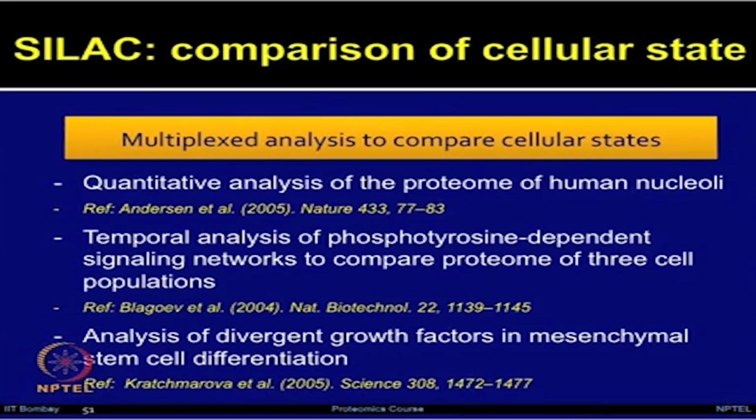These are just a few examples of multiplex analysis. Now, if you look into the literature, there are many studies which have used the SILAC method for comparison of cellular states.